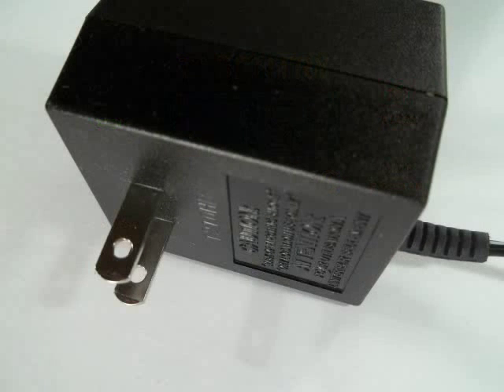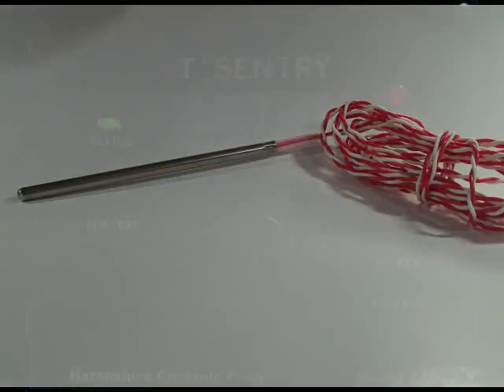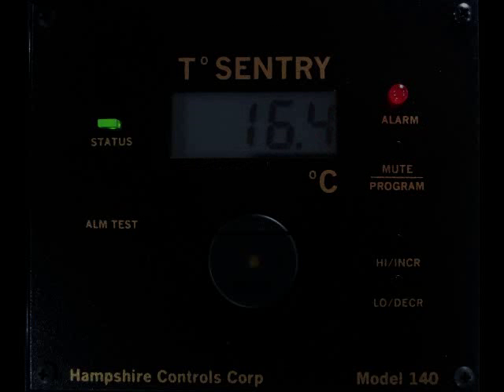Are you plugged in? Did you remove the screw to activate the battery? Is the probe in place? What do you want your alarm to tell you?